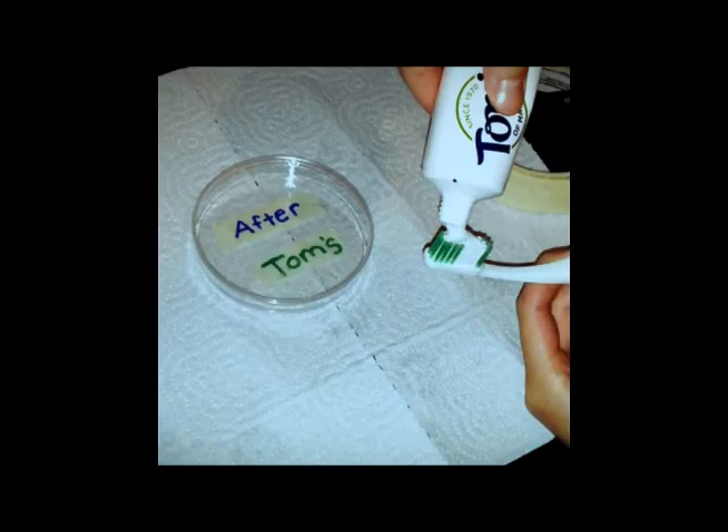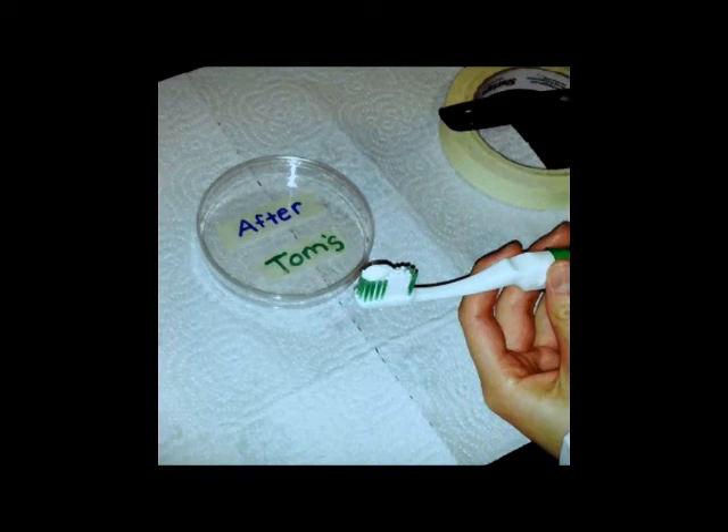Then get your toothpaste and put it on your toothbrush. Brush your teeth for approximately 60 seconds. Then rub the swab on your petri dish and tape your petri dish around. When you've finished, it should look like this.